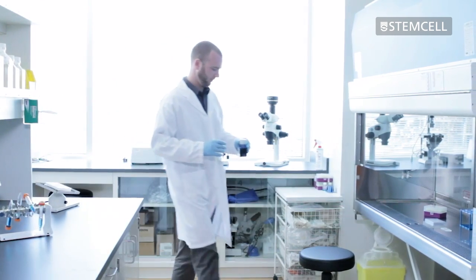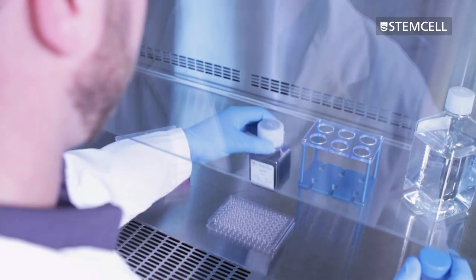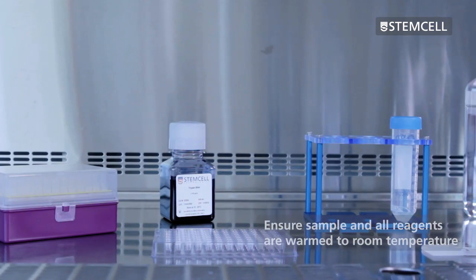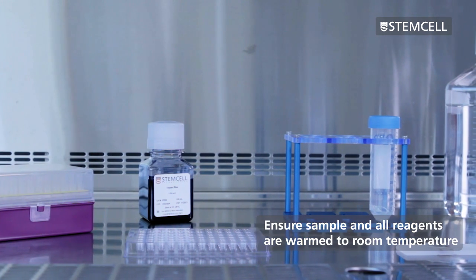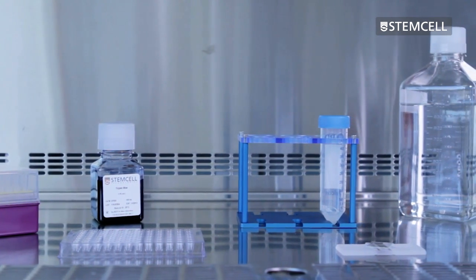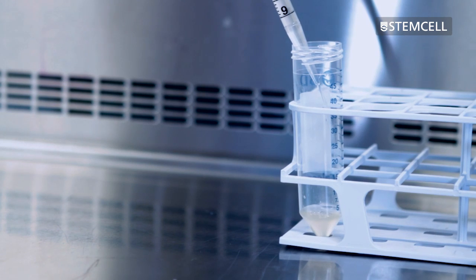To obtain an accurate representation of cell viability, all reagents, including the cell sample, must be warmed to room temperature before preparing a diluted sample of the cell suspension for counting. As with the total nucleated cell count procedure, the appropriate dilution factor for viability counts will depend on the approximate number of cells present in the starting sample. When working with PBMCs, we recommend first starting with a 10-fold dilution.